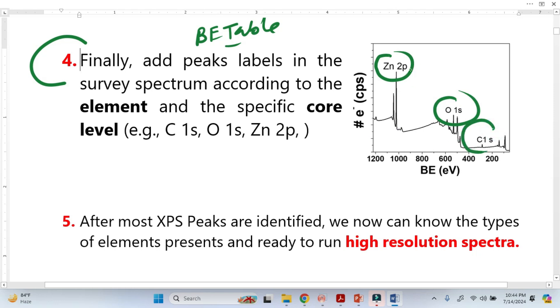These core electrons are photoelectrons, photoelectron peaks. We represent by element here, and this is represented by n here, and this represents basically orbitals or angular momentums. This is the representation of photoelectron peaks. So now we assigned most of XPS peaks to certain elements, and now we are ready to run for high resolution spectrum.